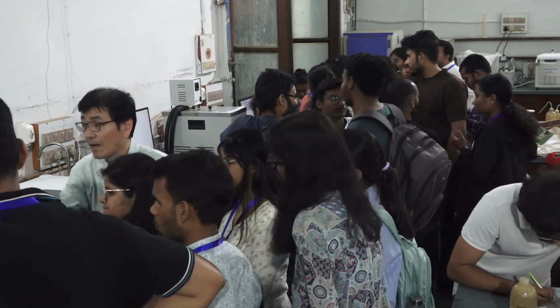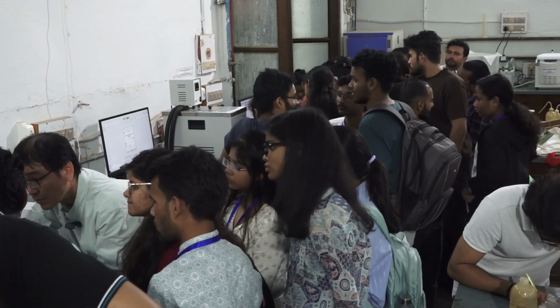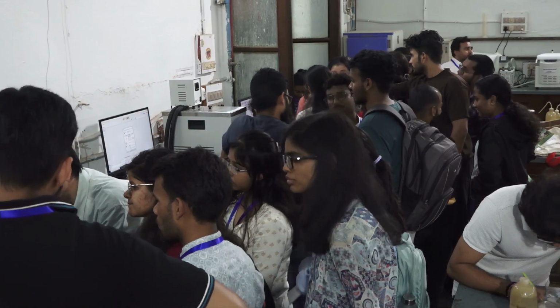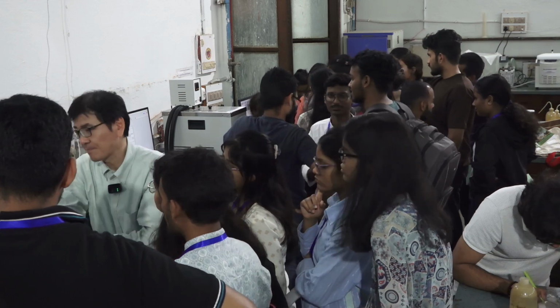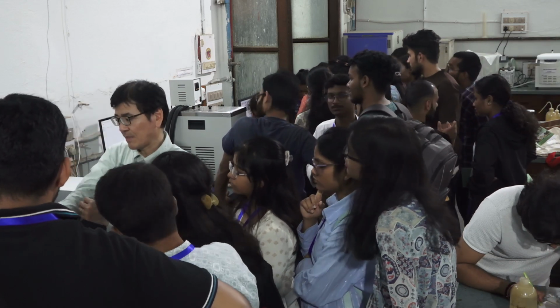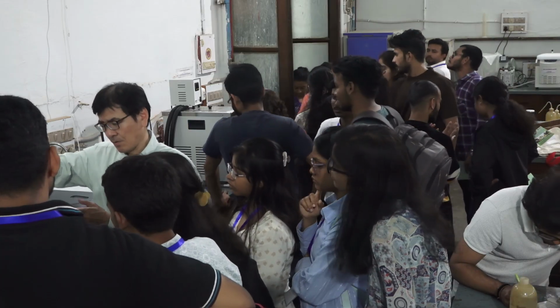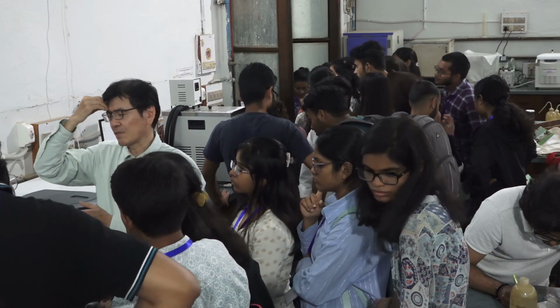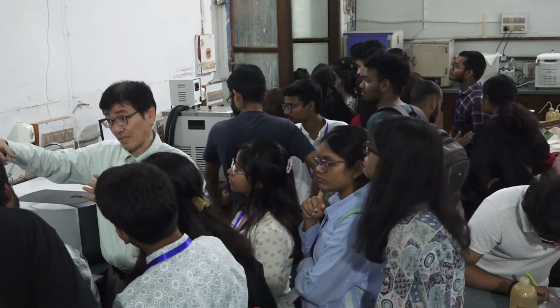What is the detection range of this system, for any component? It is determined by the ability of the detector, so it depends, but usually 6,000 or 7,000.